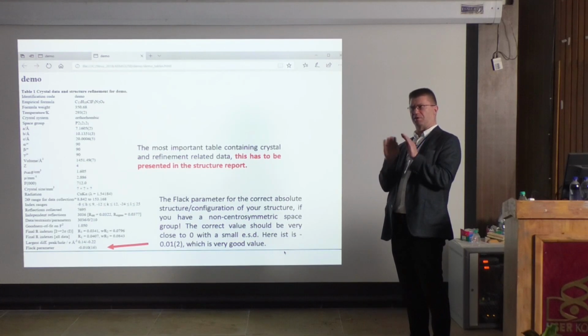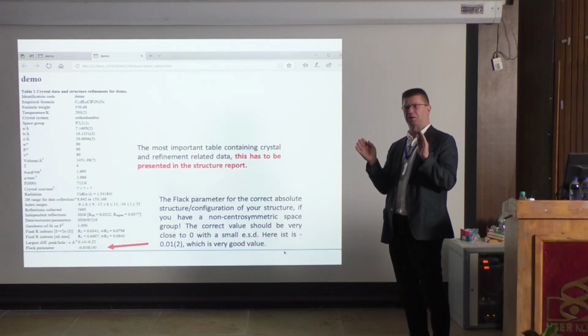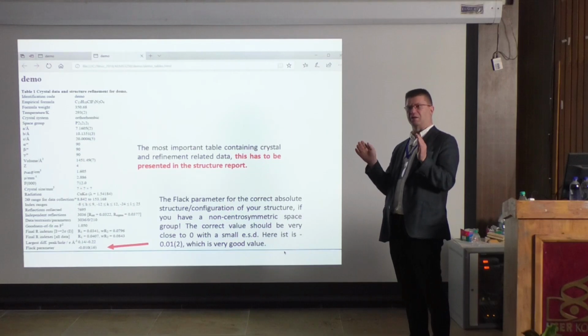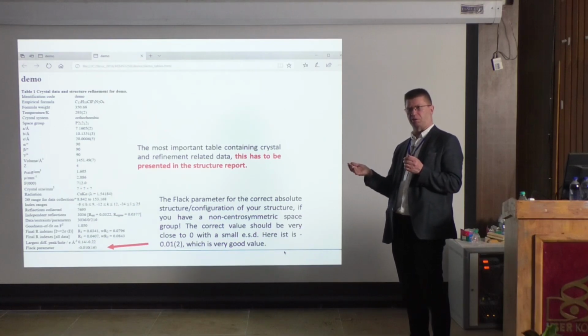And now this difference depends on many things, but in essence it depends on the handedness of the molecule that you have. And then we can use this separation to do a mathematical calculation, to see whether it is the left-handed or the right-handed molecule.